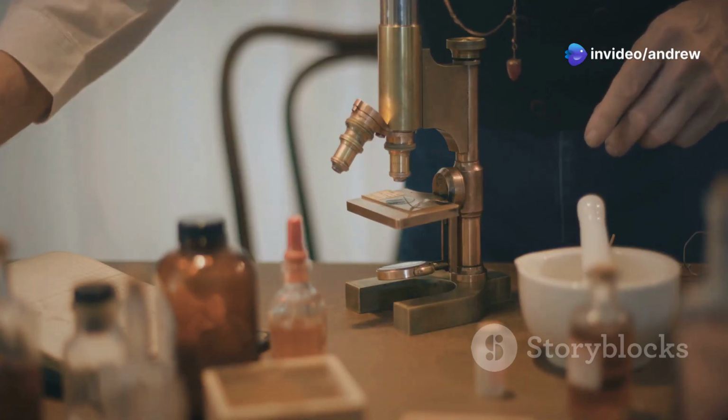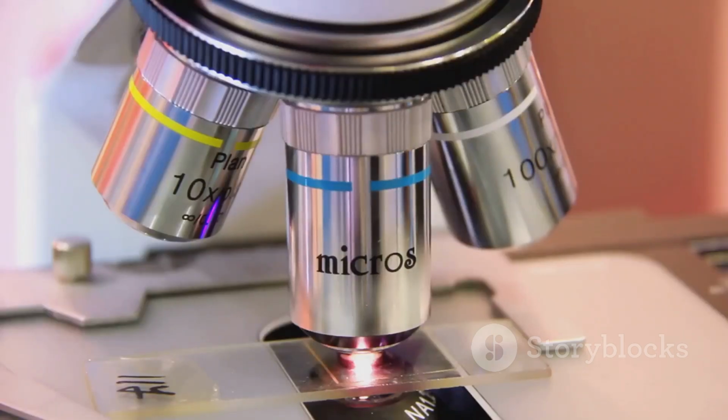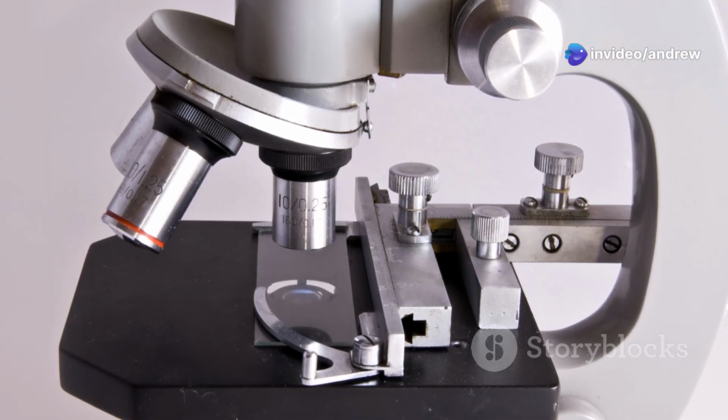Optical microscopes, which use light to magnify objects, have been around for centuries. However, even the most powerful optical microscopes are limited by the wavelength of light. This means that they can only magnify objects up to a certain point.